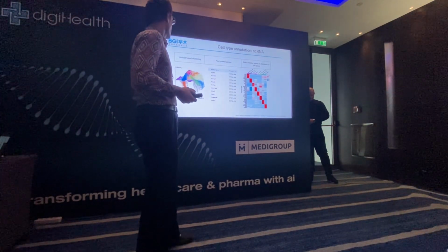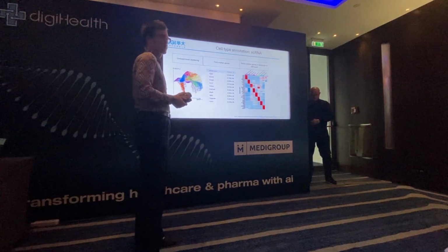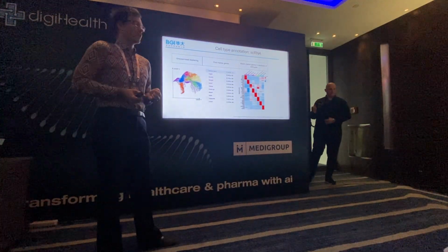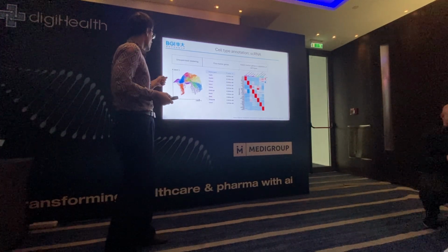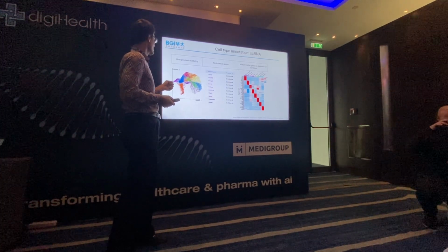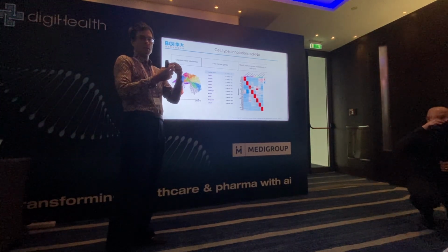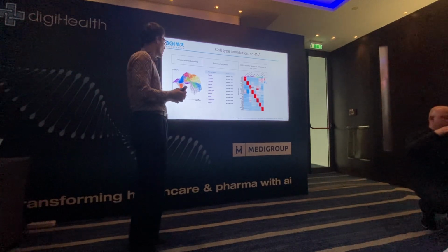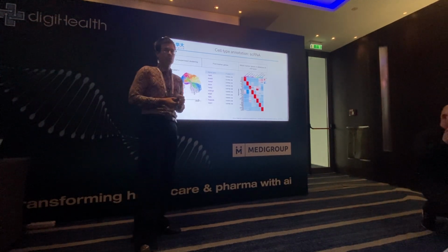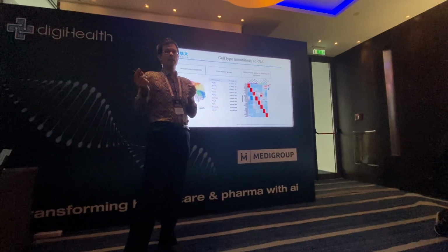And in that technology, the flow for obtaining cell types is usually done in these 3 steps. So when you have this cell gene matrix that I mentioned, you firstly would perform some unsupervised clustering to see which cells are similar to which and to group them together, to cluster it. Then for every cluster, you would find which genes are expressed in it and not expressed in the others.